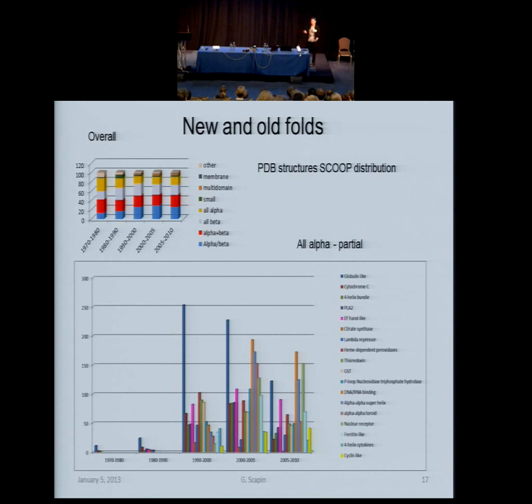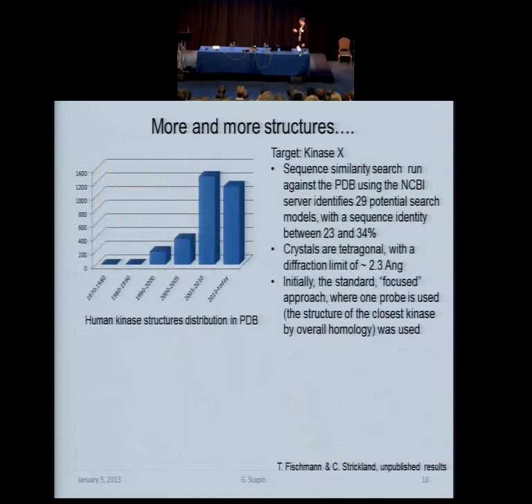it doesn't. And just last year, we had a little example of this in our laboratory, and the protein was a kinase. I think the kinases are the most represented proteins in the database. This is a human protein kinase. There are over 3,000 structures in the database.